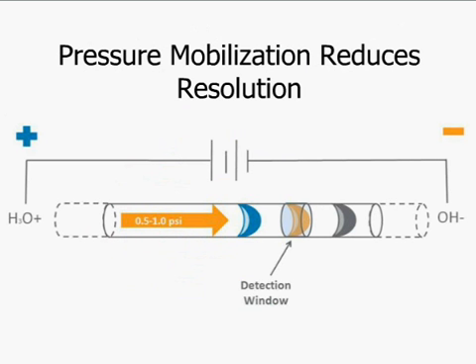Now, applying pressure to the focus gradient in a traditional CE system can allow for detection of the analyte components. But this method, while preserving the spacing of the gradient, leaving calculated pI unmolested, introduces laminar flow in the capillary through the hydrodynamic force used, significantly reducing resolution.